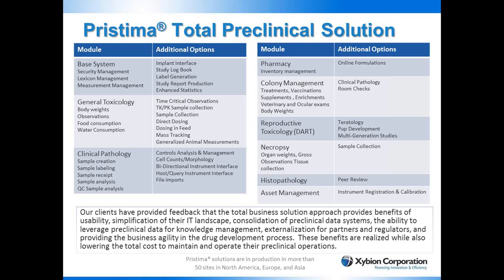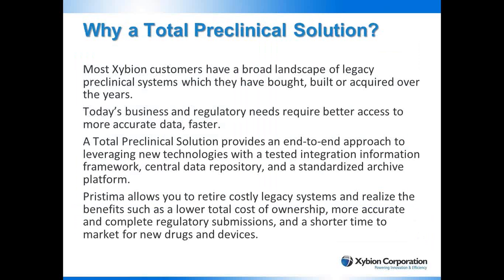This has been a huge cost savings for our clients, and as we push out some of the case studies and some of the press on the new clients, they all report back that one of the key decision criteria that came into play when they selected Pristima and the benefits they've derived after having used it for a period of time, hands down, was that total solution being able to eliminate some of the legacy applications that were relatively expensive to maintain, and worse yet, were probably not really communicating with other systems in a fashion that facilitated analytics. So most of those customers, of course, have a broad landscape of these legacy preclinical systems which they've bought, built, or acquired over the years.